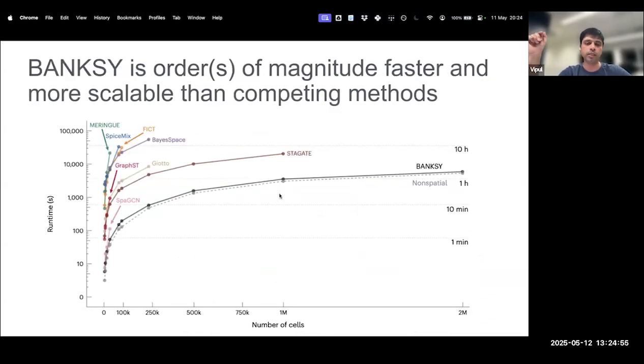Like I said, the method has to work well first, but scalability is a close second in terms of how important I think it is, because BGI has a method that measures millions of cells, and all the data set sizes are getting larger and larger. You need a method that can handle very large data sets on reasonably sized compute, right?